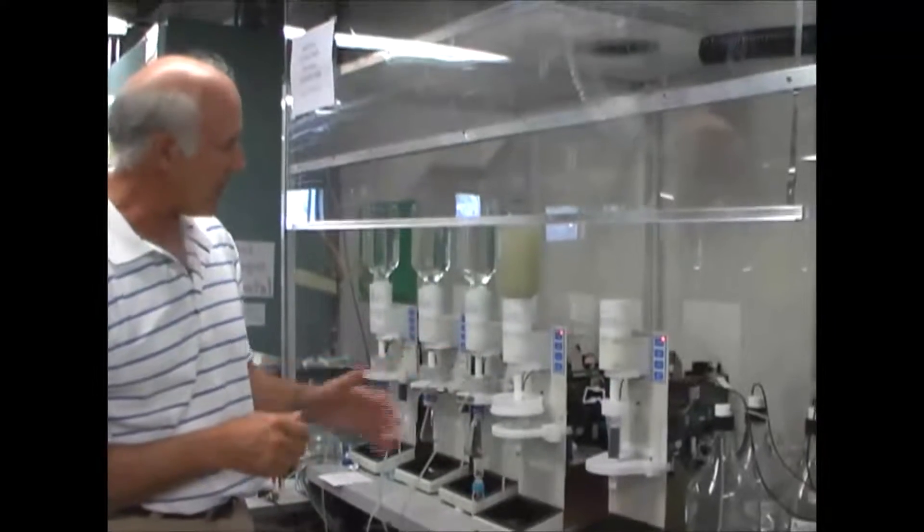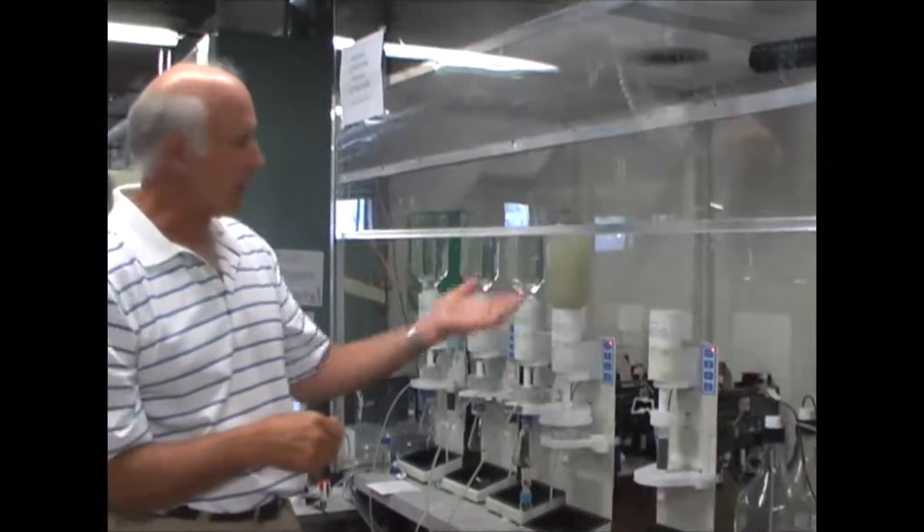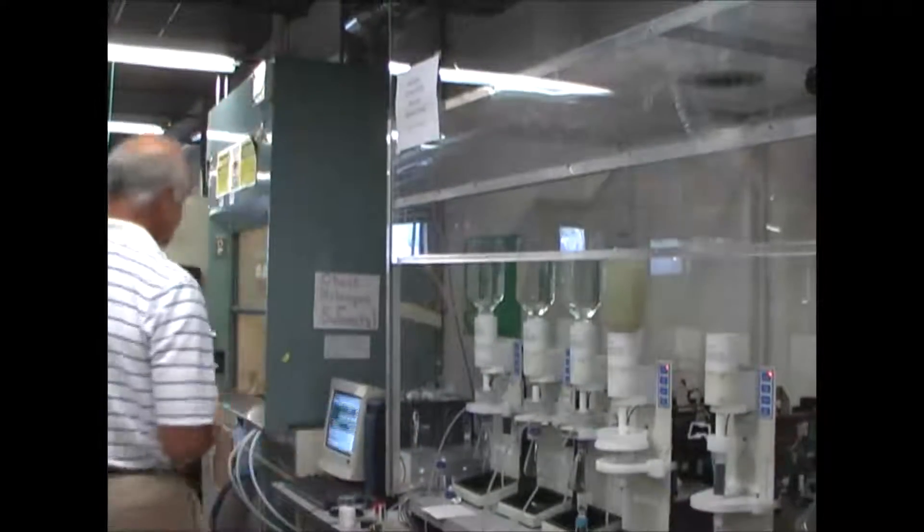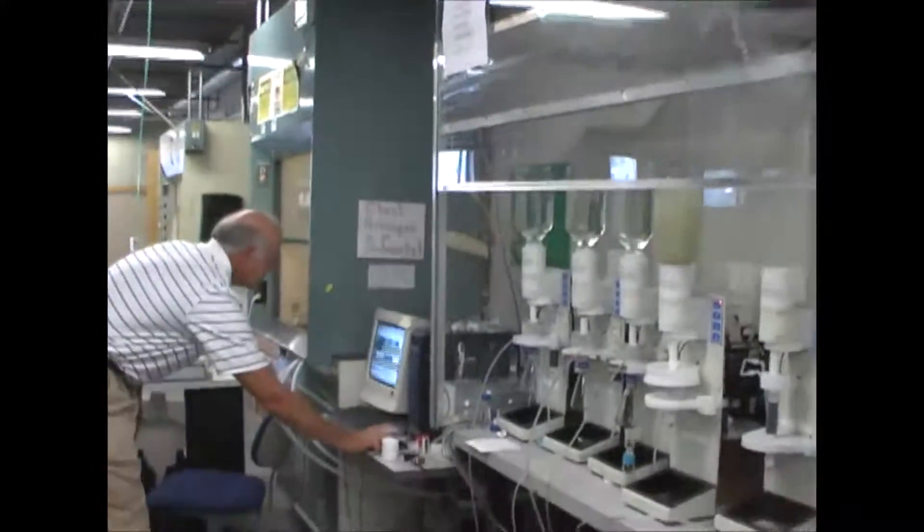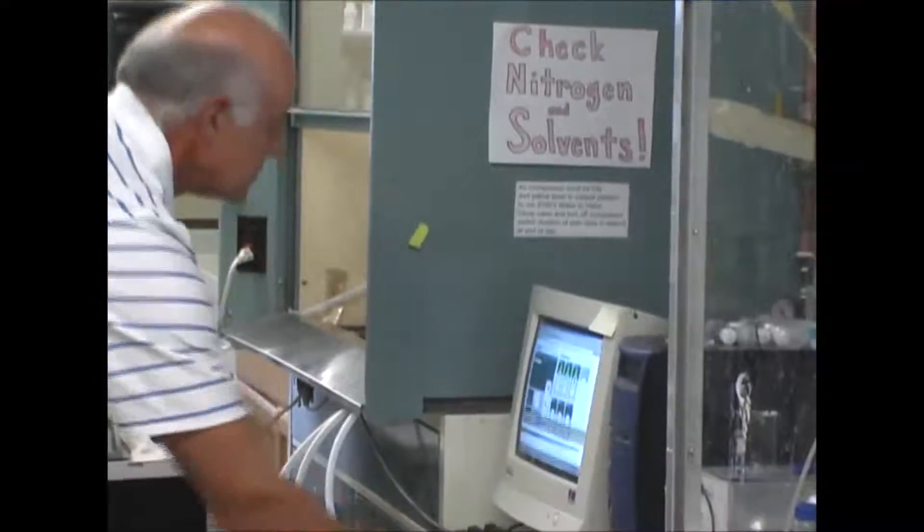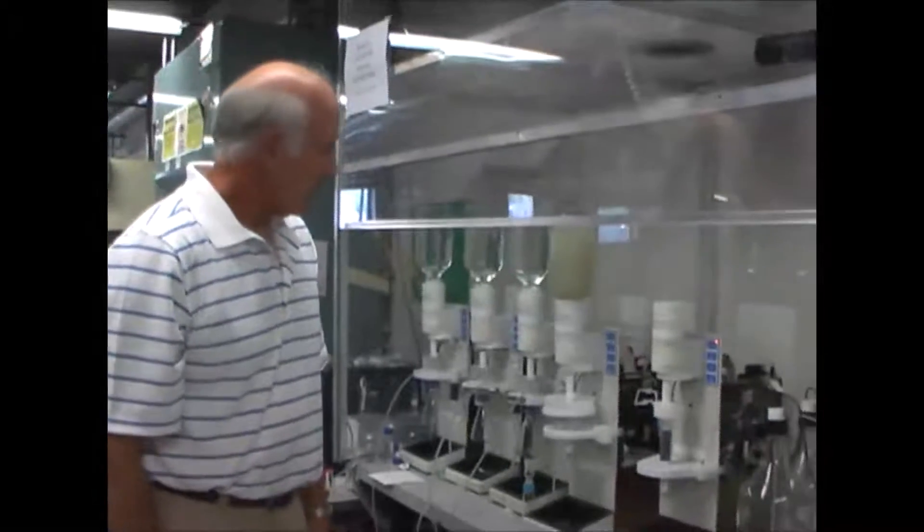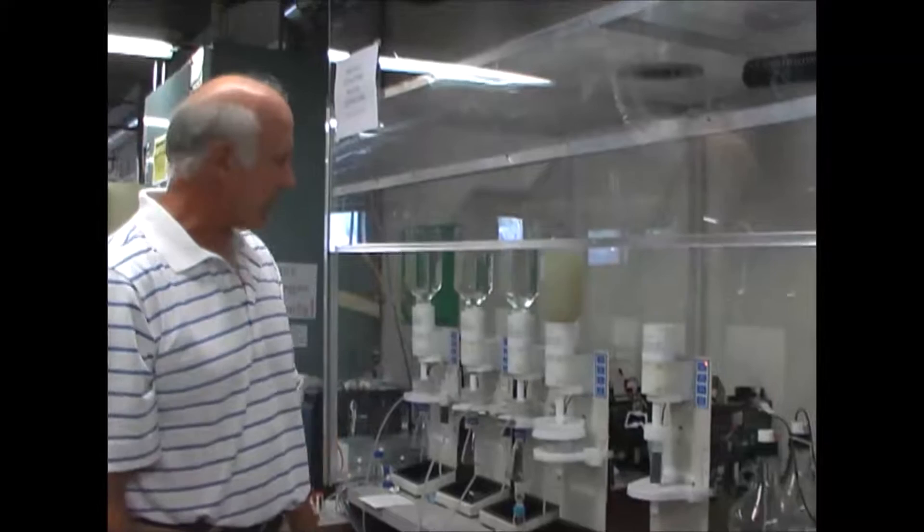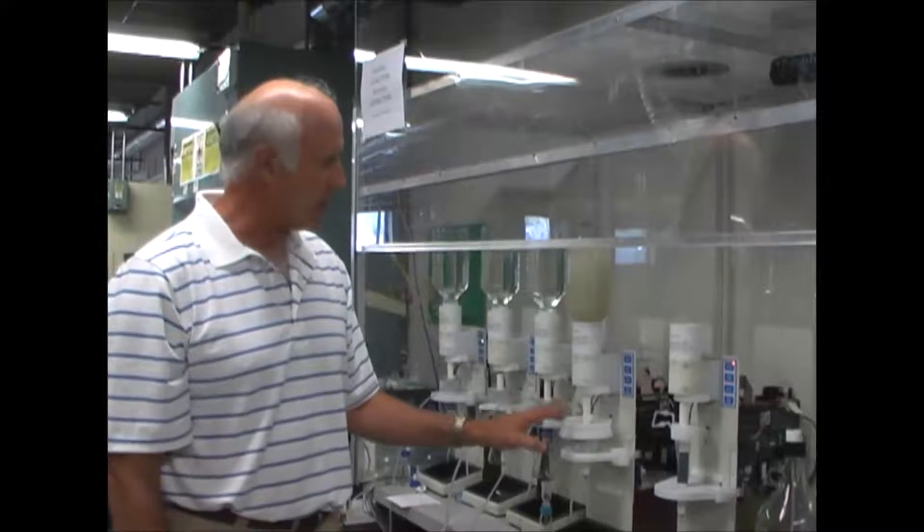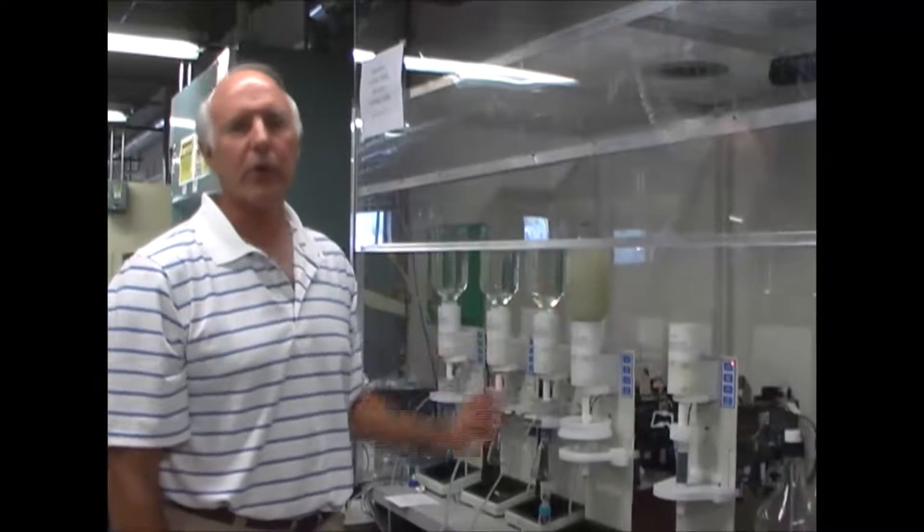I've got a demonstration method that I will run, and what we're really going to do is look at the time it takes to filter this sample. So I've started the extractor. The unit is going to deliver a pre-wetting solvent, which in this case is acetone. It's just going to condition the pre-filter and the disc, and once the disc is conditioned, we will immediately go into filtering the water sample.